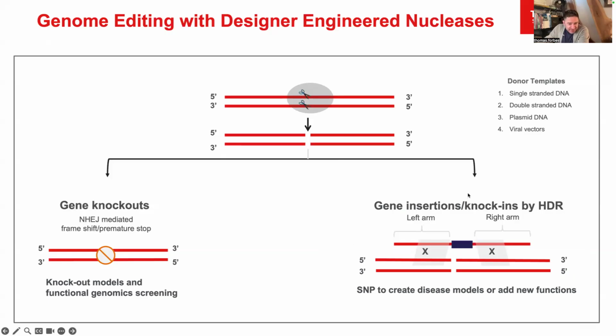And as you can see in this figure on the right, those left and right homology arms of that same sequence essentially flank that break site, and that allows the donor template to be incorporated into the genome right at that exact spot. Generally speaking, there's three main materials required here. The first is a specific and efficient nuclease system. The second is a repair template that contains that desired change. And then the third is a method to deliver them into the cells. And so it's really the collection of these materials together that allow the edit to occur at the molecular level.